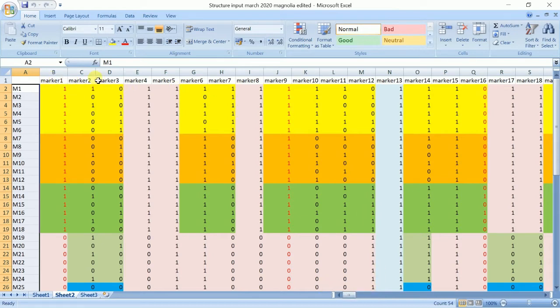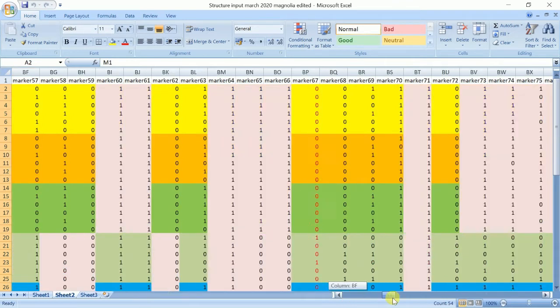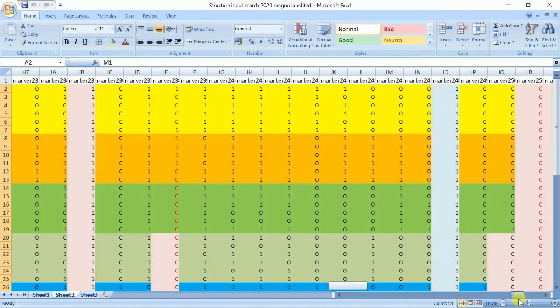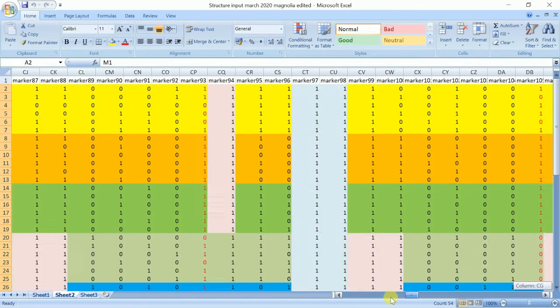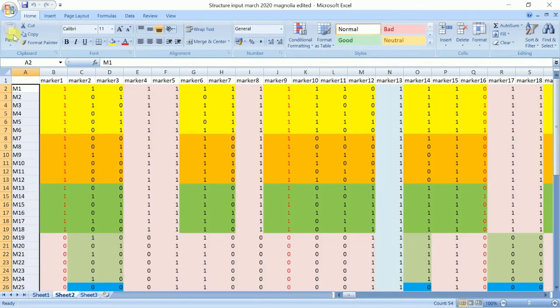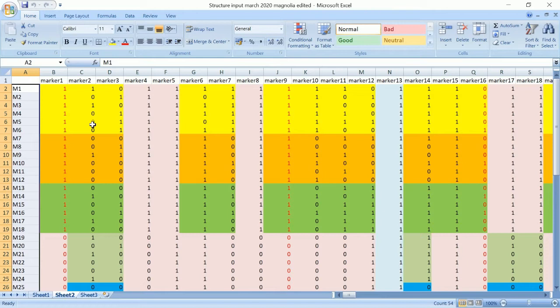You can have different types of markers here, but it should be numbered accordingly like 1, 2, 3, 4 till total number of primers you have. We have 276 number of bands given by the primers. These are done, and it has to be in transpose. So this file you have to save it in other format.